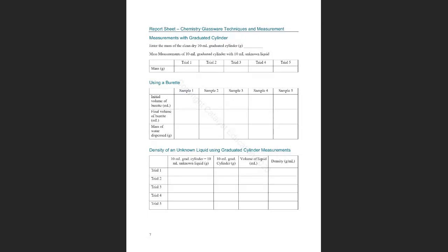Now let's go to the first part of the report. If you do an experiment, you have to do several measurements because each measurement will have an error, and then you are going to calculate the average. Let me look at what the data is, because you're not in the lab. All of this is going to be given. When you click on your report, these are numbers that are going to be in red. It's going to be given.